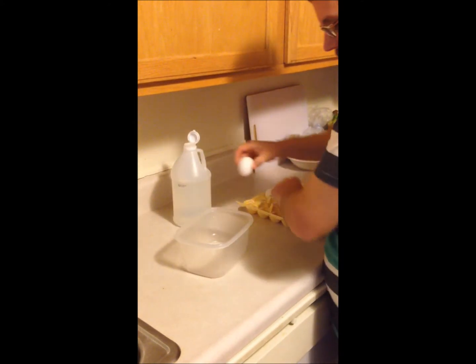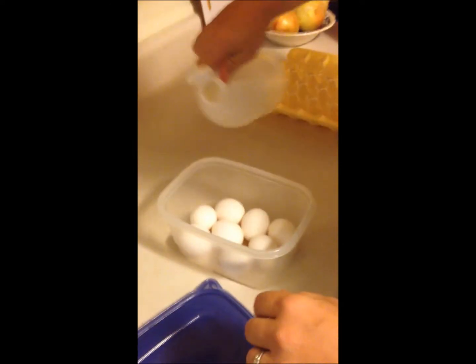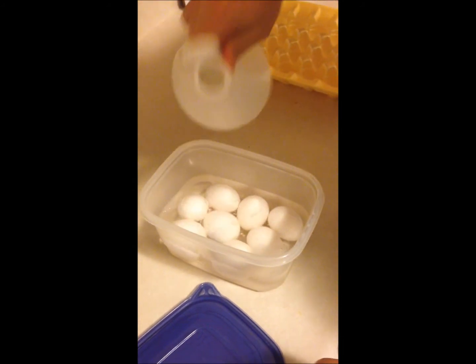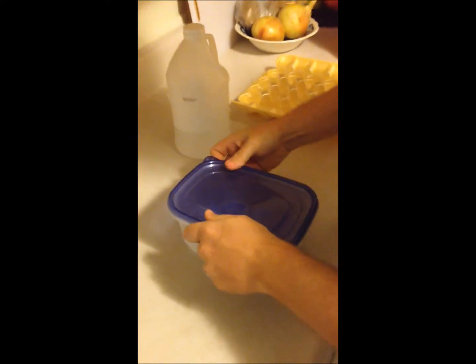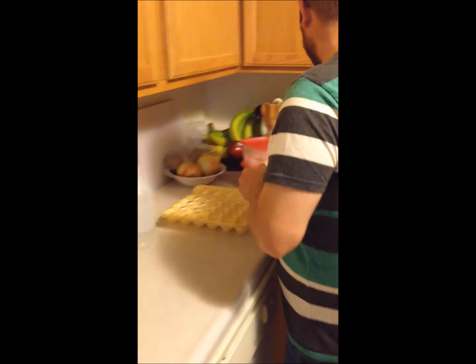Next container. Now they're ready to go in the refrigerator.